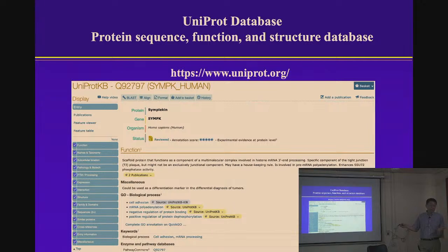How do you solve that problem? You BLAST. So you take your protein, put it into BLAST, you select PDB as a database, and you find all the structures that are homologs of your protein based on sequence in the PDB. You know how to do that, right? Okay, you can select the database when you do BLAST. So select PDB as a database. Now you find all the structures that are homologs to yours. Okay, so I think that's it for crystallography.